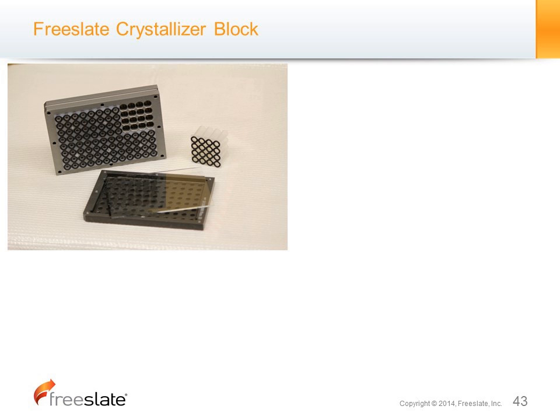I think the question is about the size of the tube. So we're talking about the height of this tube and the diameter of the well that is formed, which I don't really have off the top of my head. But the idea when we select the 2 different steel balls is to obviously fit into the hole, but not be big enough to just jam in there. You do have some room to wiggle. But the ball size I gave to you already.